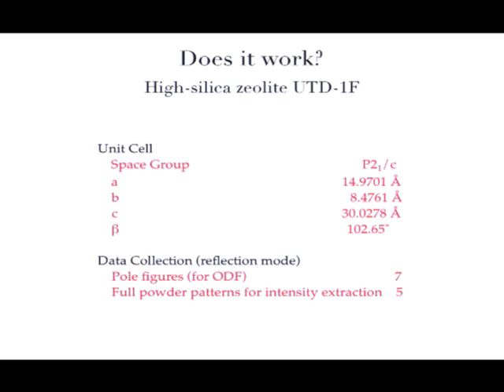We collected all these 1100 powder patterns, selected 7 non-overlapping peaks, from which we calculated the ODF, and then we measured 5 full patterns to extract, to deconvolute the overlapping reflection using the texture measurement.